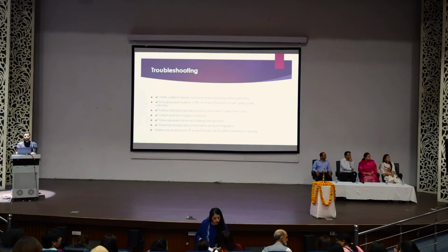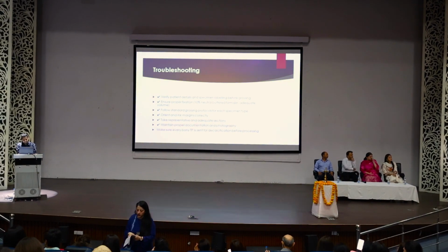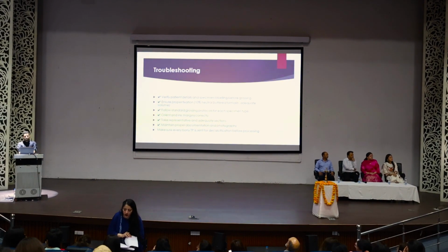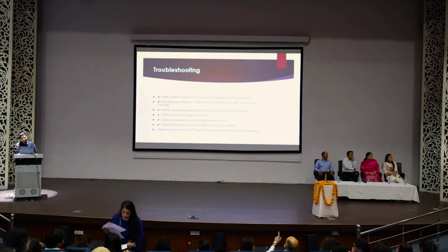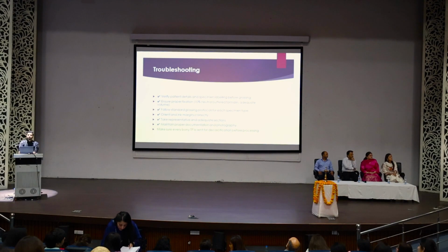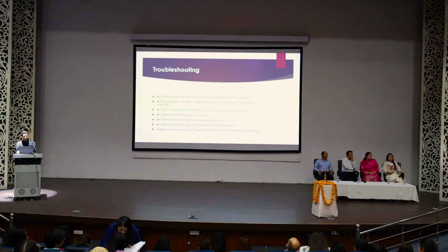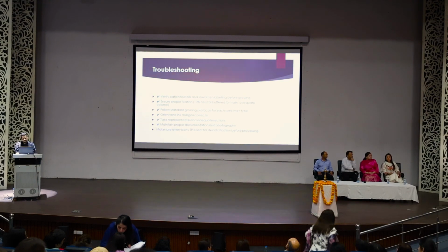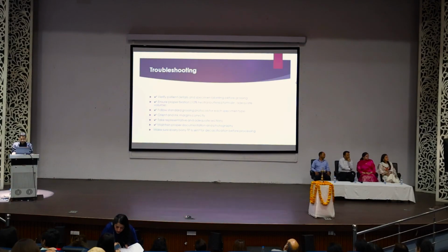Troubleshooting. You need to verify patient details and specimen labeling before grossing. Ensure proper fixation, 10% neutral buffered formalin, adequate volume. Follow standard grossing protocols for each specimen. Orient and ink each margin so that the reporting pathologist will be able to find the positive and negative margins. Take representative and adequate sections. Maintain proper documentation and photography. Make sure every bony tissue piece is sent for decalcification before processing.